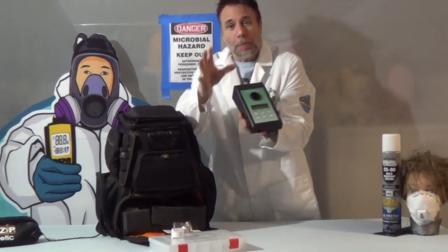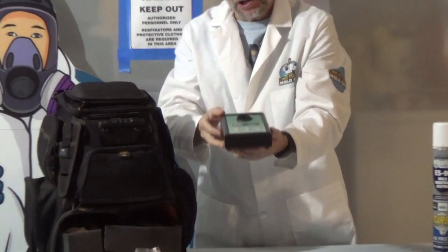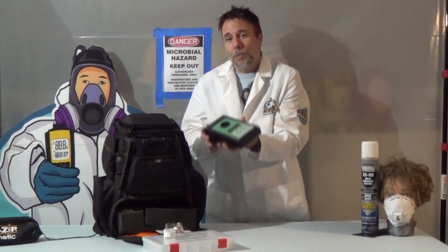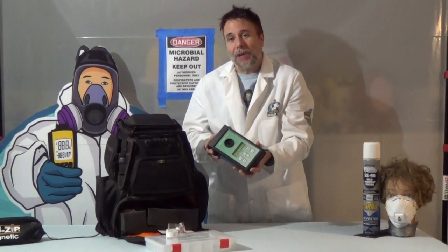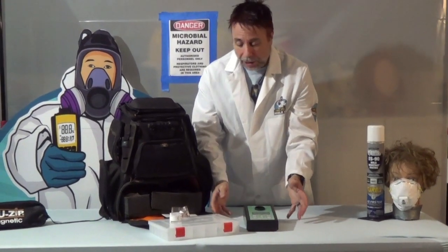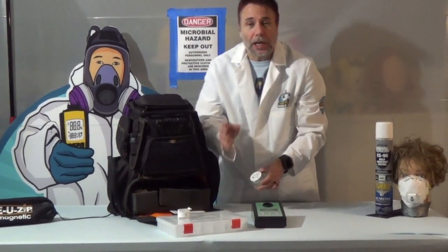What this is comes in many variations. This one happens to be cordless and can be recharged, but there are many kinds. This is an air pump — it's going to suck in the air. And if you call to have a mold inspection or a mold assessor come into your house, more than likely you're going to see some variation of this.